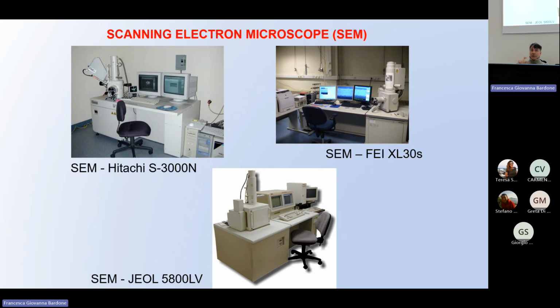Remember, if you have water, you remove the water and substitute it with other molecules to fix the shape. It's not hydrated anymore. It's fixed. You can observe the morphology, but you change the water molecules with other molecules that could keep the shape, the morphology, fixed.